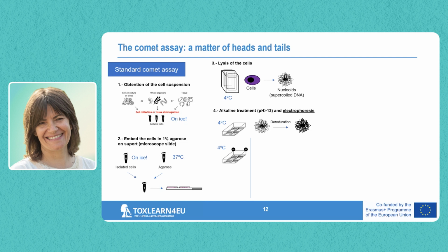Why do you need it? Well, in fact, you don't need it. You will see later why. You can do it without, and you will see the effect of having breaks in the DNA. It makes the assay a bit more sensitive. I will explain why later.